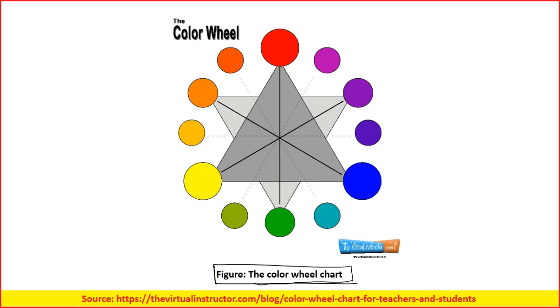In absorption and emission, whenever we're dealing with this, we have to look at the complementary of the color we're looking at. For example, the complementary of blue is orange, of yellow is purple, and of red is green. It's about which wavelength is getting absorbed and what we are receiving. They are usually complementary while doing spectroscopic data. So I think that is why this color wheel is important.